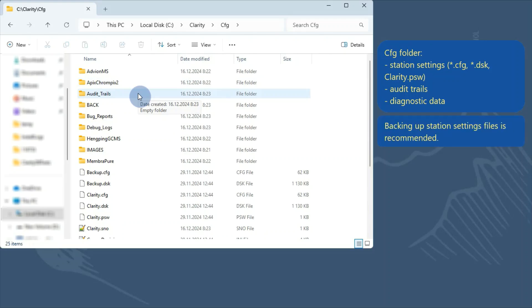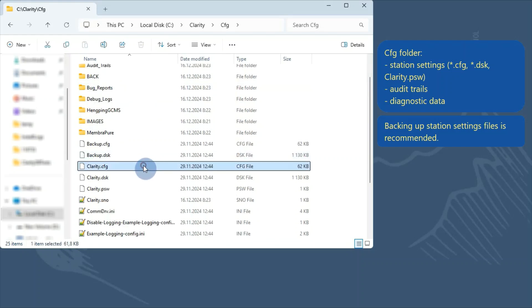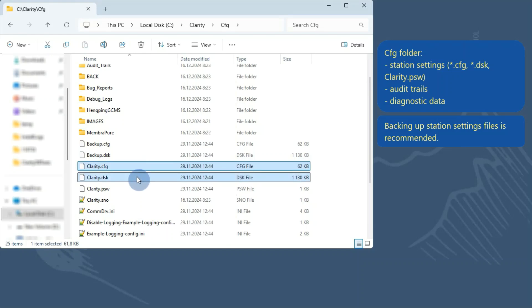So if you need to transfer or retrieve the settings of the station, the following files will be necessary: any present configuration .cfg and desktop .dsk files, and the Clarity.psw file.